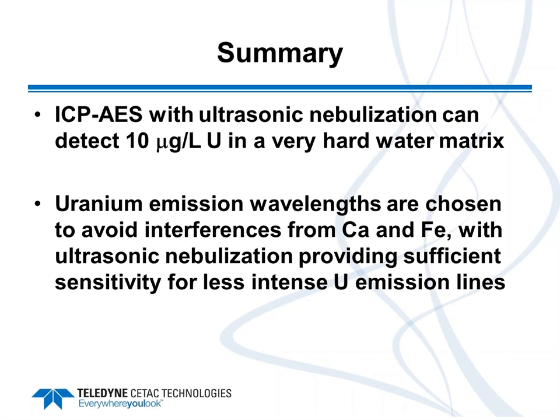Does this mean that the ultrasonic nebulizer eliminates the problem of total dissolved solid content, TDS? No, the ultrasonic nebulizer will not remove non-volatile inorganic solids. In fact, it will actually send more of it into the ICP. So with that in mind, you have to be wary of the dissolved solids content.